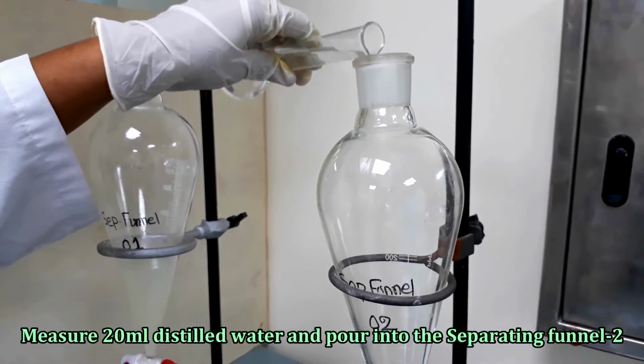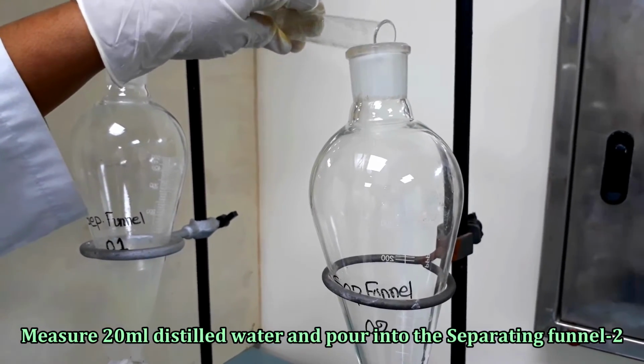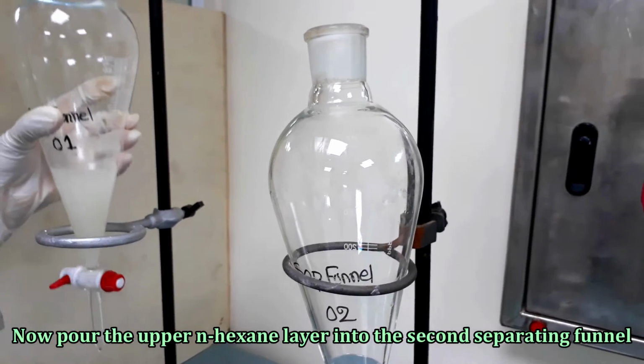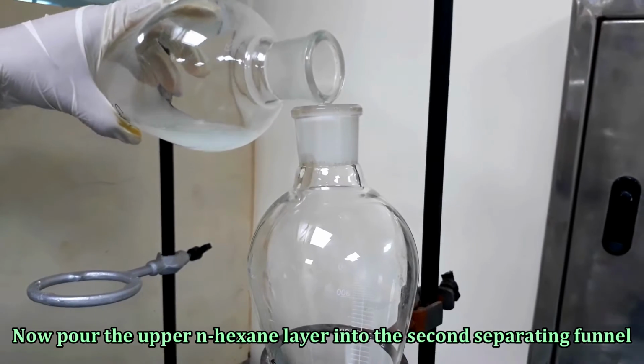Pour 20 ml distilled water into another separating funnel. Now pour the upper n-hexane layer into the second separating funnel.